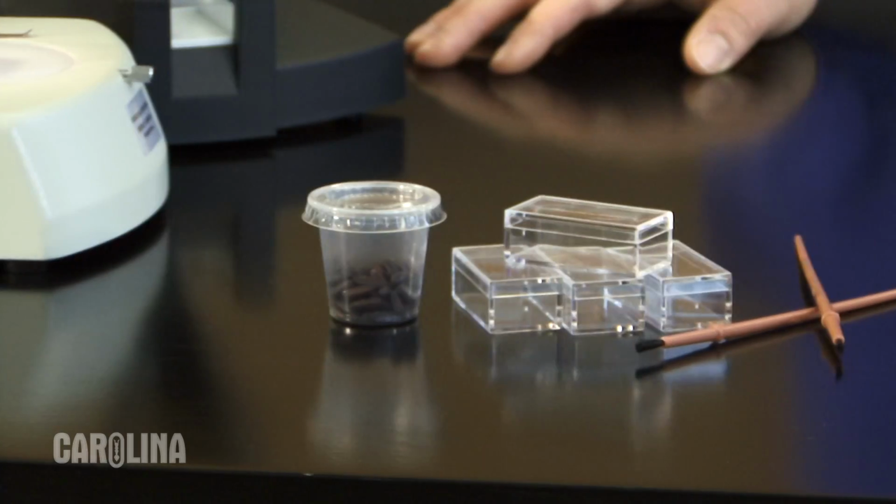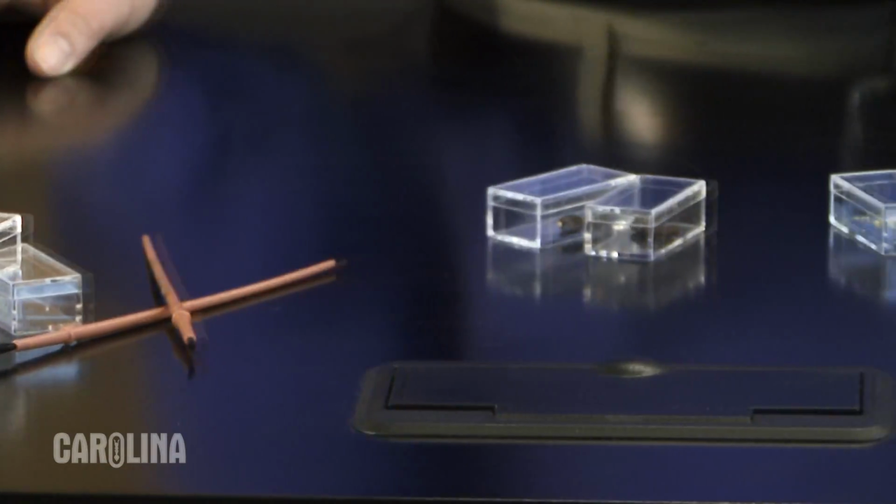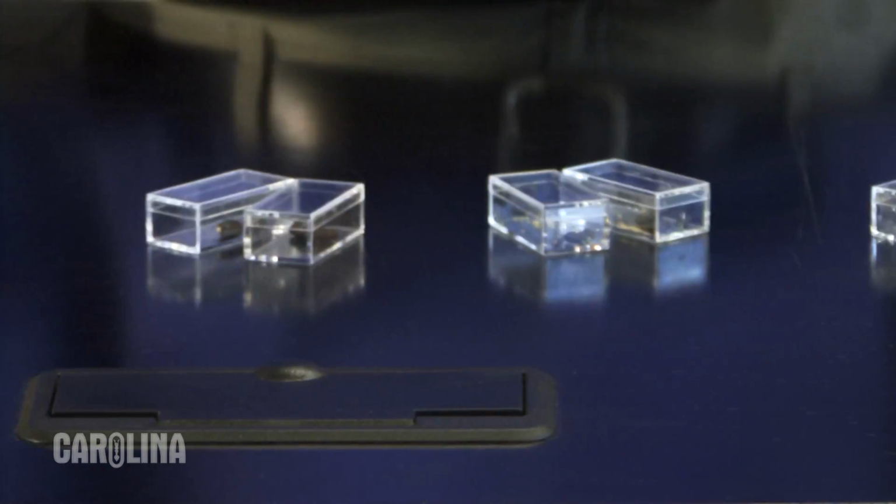Today, I'll discuss receiving and handling the parasitic wasp, Melittobia digitata, or the WOWBug, an easy-to-use insect for life science studies in the middle school classroom. WOWBugs are easily cultured. They take up very little space in the classroom, and even though they possess a stinger, they are incapable of stinging humans.